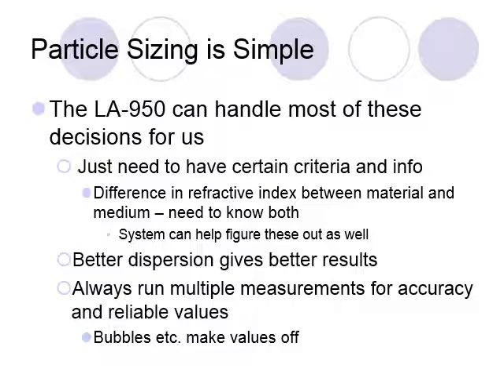You also want to run multiple measurements, making sure that it's stable, making sure that you have enough ultrasonic to keep things broken apart. Look out for bubbles. The system will see a bubble like a spherical particle. So if you generate foaming, things like that, these are just practical things. Particle size is a very practical measurement. You need to understand how you're doing it far better than you need to understand all the details of the machine. It's the sample making part that you spend more time on in getting a good measurement.